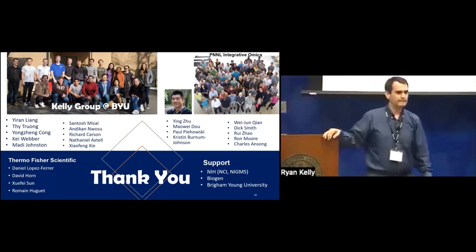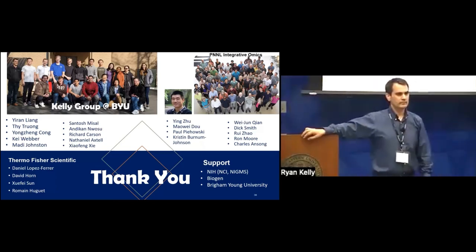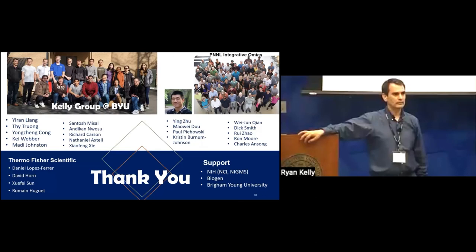I was just going to comment that in all our strategies we do not apply any thresholds for retention time difference or m/z, but really compute the score, and that then goes to the statistical analysis to figure out the false discovery rate from MBR, right? Because you don't know what m/z tolerance or retention time to apply until you let the model model the data.